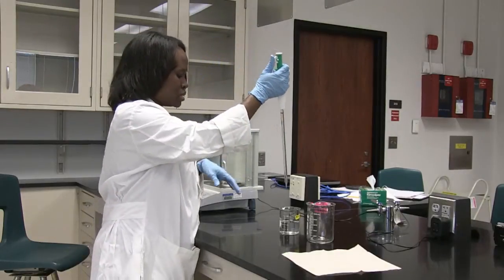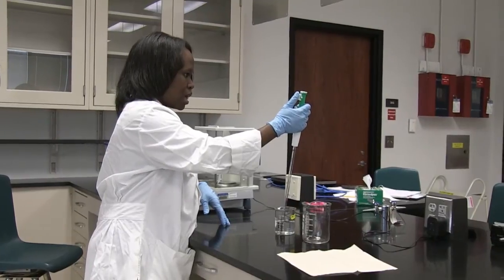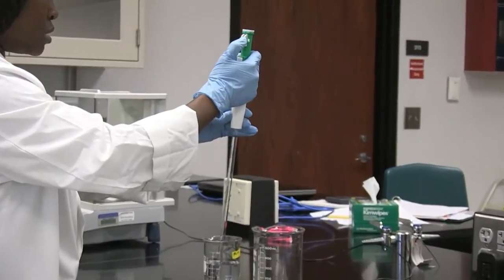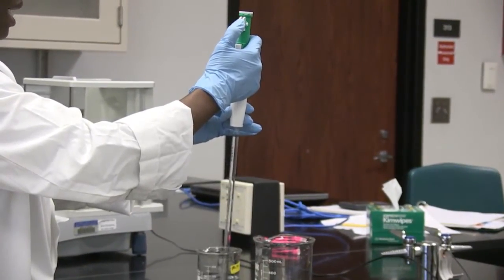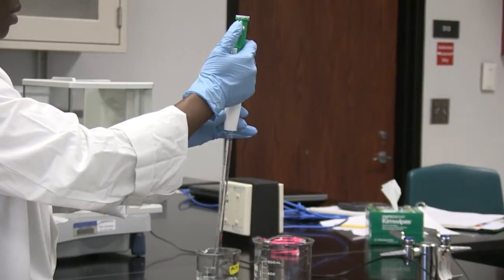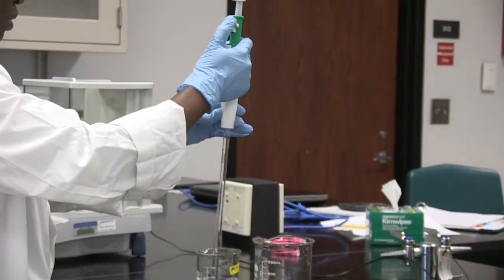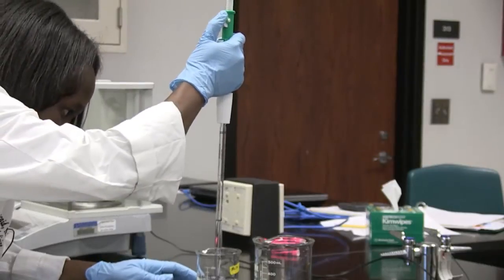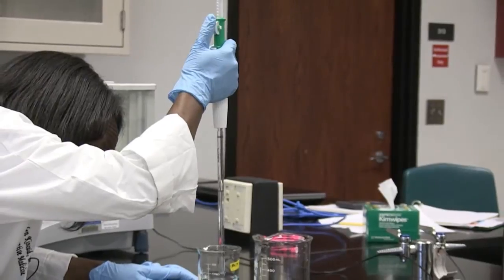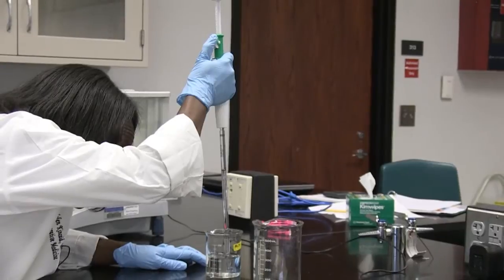I'm going to immerse the tip of the pipette into the liquid, and I'm going to use the rotating wheel to get the volume into the serological pipette. In order to get the liquid up into the pipette, I'm going to move my rotating wheel in a clockwise direction. While I'm doing that, I'm looking carefully at the volume of liquid each time I roll it up. And I'm going to stop at the 10 mil mark, which is about here.